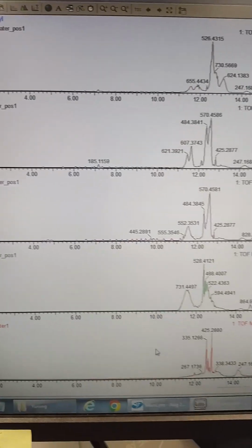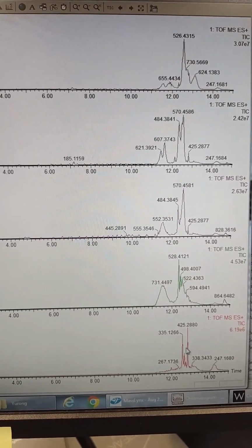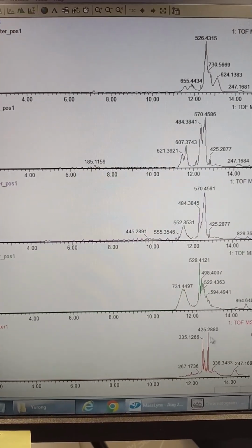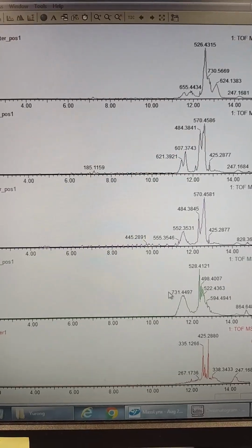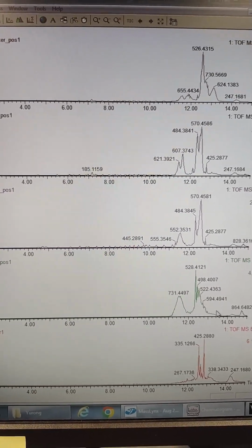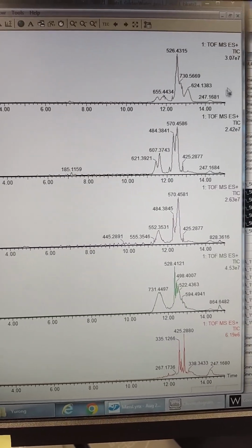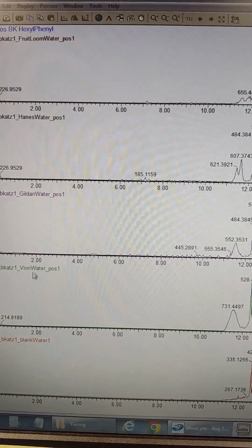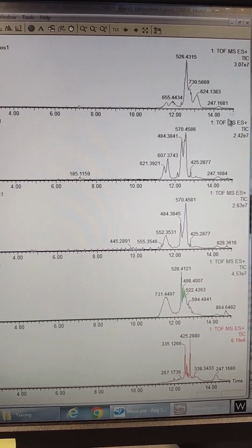Alright, first glance, you can see the blank is pretty blank. 6e to the 6, couple things out there at the end. Those are just phthalates I can never get off my system. But then you can see most of the stuff is later in all the shirts. So we have a lot of non-polar, kind of hydrophobic stuff that we've extracted. See all the signal, the most intense signal is actually in the Viori shirt. You see that 4e to the 7. But everyone's kind of in that same range.